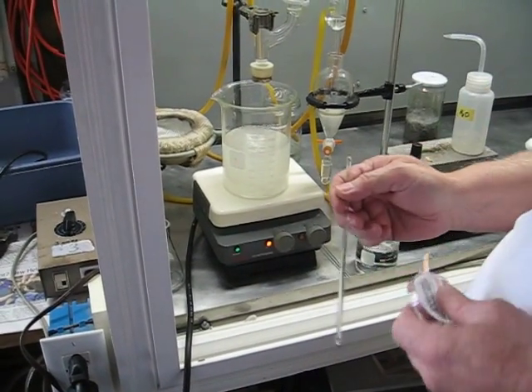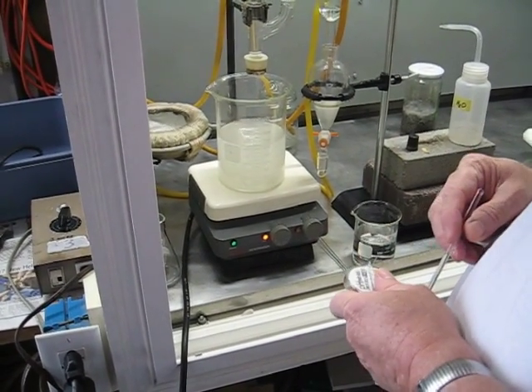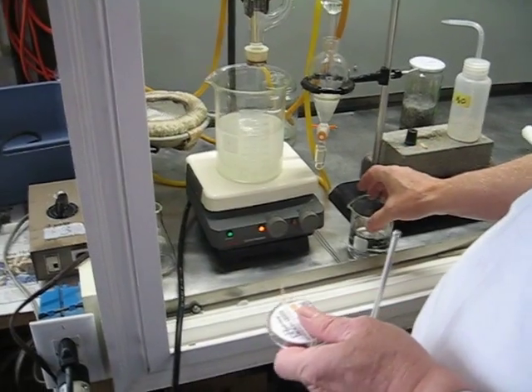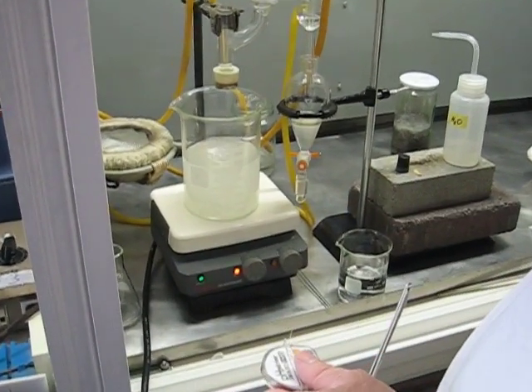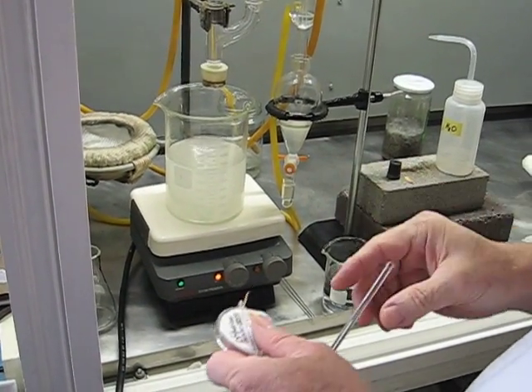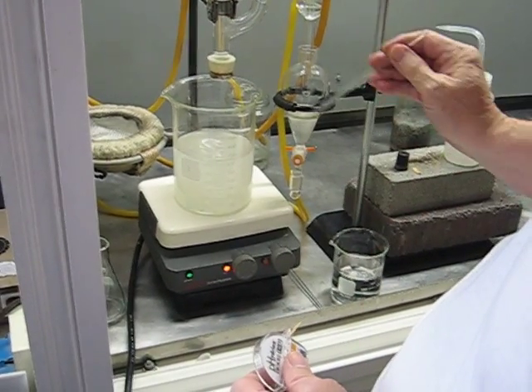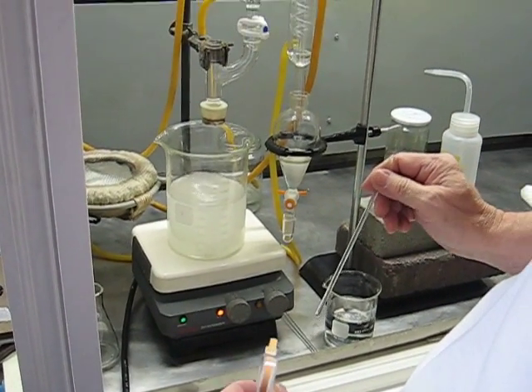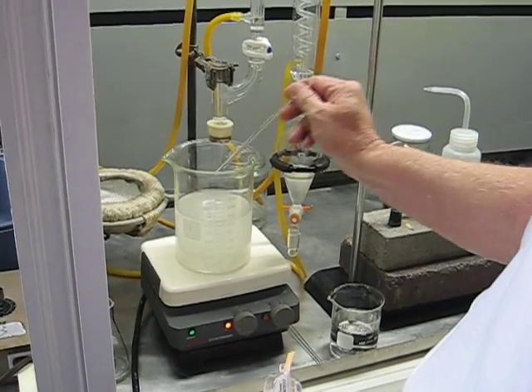Go ahead. This is going to be a movie of the precipitation of sebacic acid out of a solution, an aqueous solution at pH 6. I'm going to take it down to pH 2.